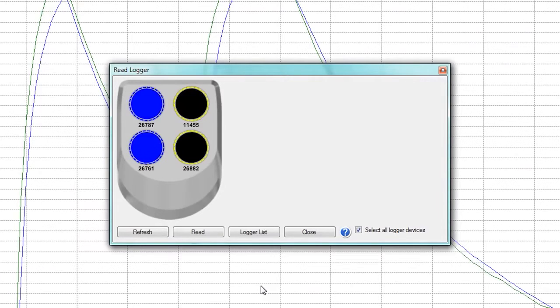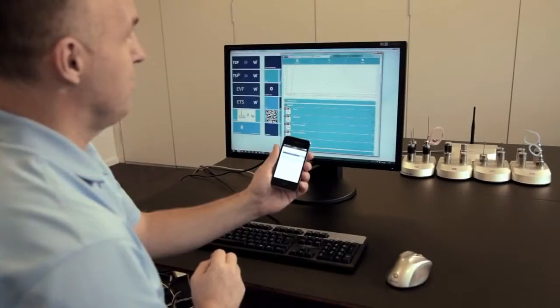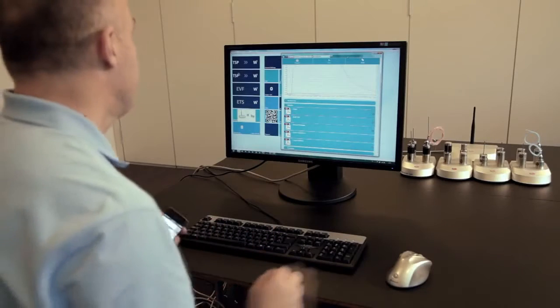Stop the session. Look on the computer and click Read. The session is finished, and in the ValSuite app, the session is no longer yellow. When data is read, it's easy to print the reports from the PDF.